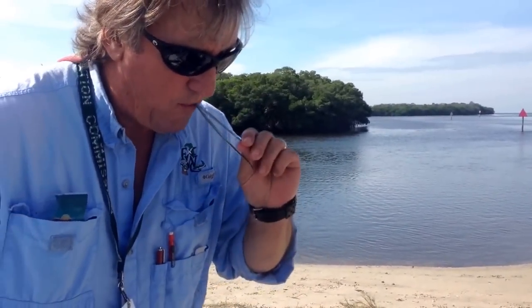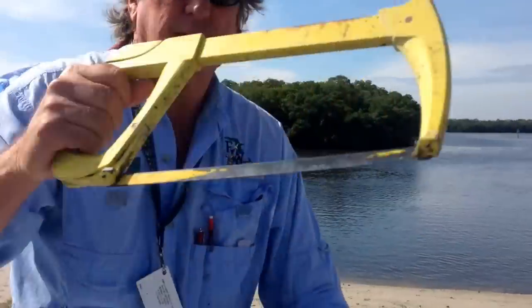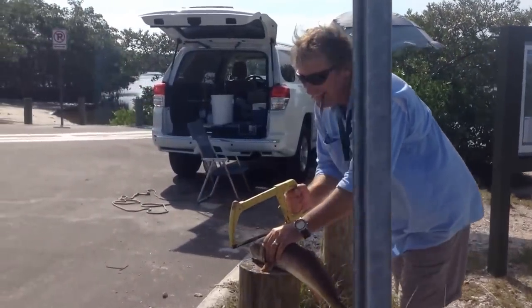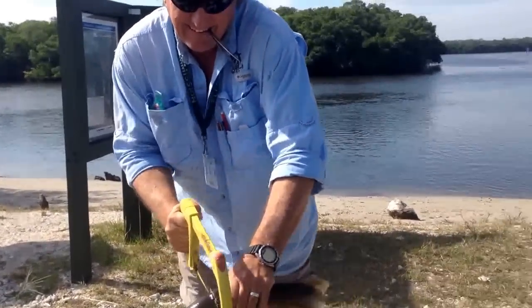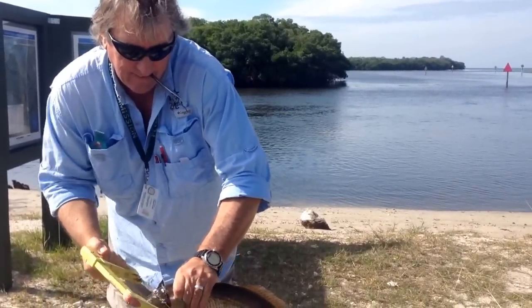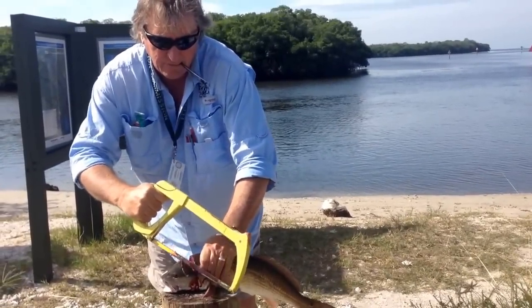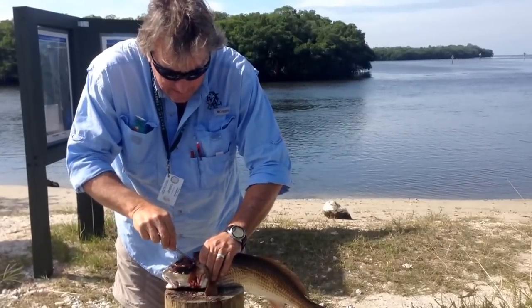Now for the dissection part — they use a hacksaw to get the otolith stone. These fish have hard heads, so with snook and trout you can use a knife, a serrated knife, but on these guys you need the hacksaw. If the fish is over the size limit, you throw it back.